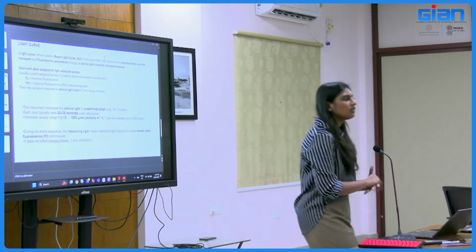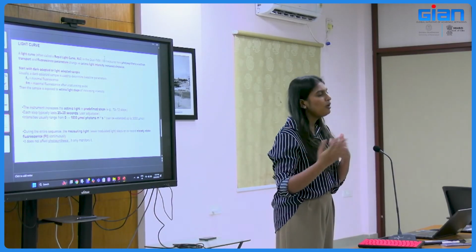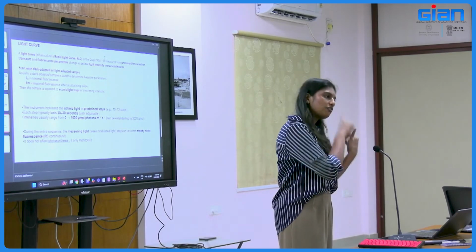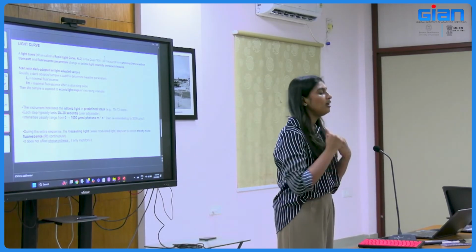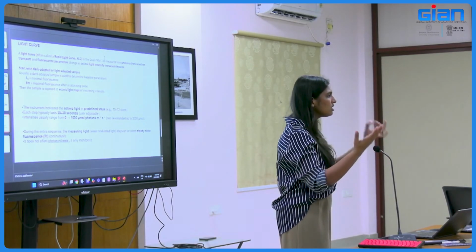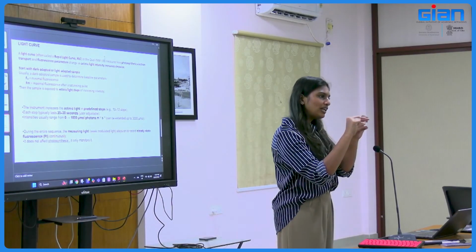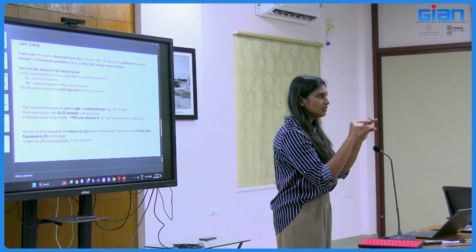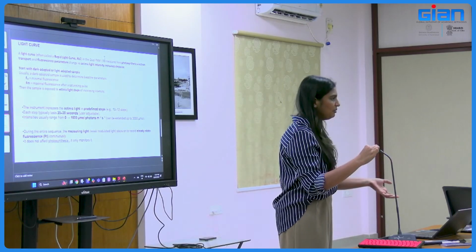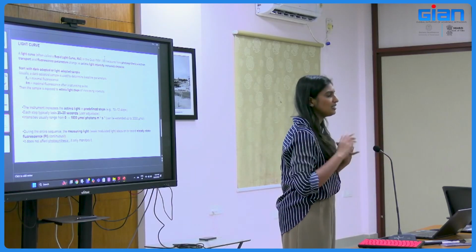So we are not going to use all the parameters of dual PAM. You can use different probes. You can study cytochrome B6F individually. You can study the kinetics of PS2. You can study the kinetics of PS1. Then you can study ATPase activity. These all can be done using dual PAM if you have the proper probe. Why? For cytochrome B6F, you may need a particular wavelength. Everything gets excited at a particular wavelength. If you have the probe, you can do all these experiments. So basically we work with the P700 probe, which is for PS1 kinetics and all we do.